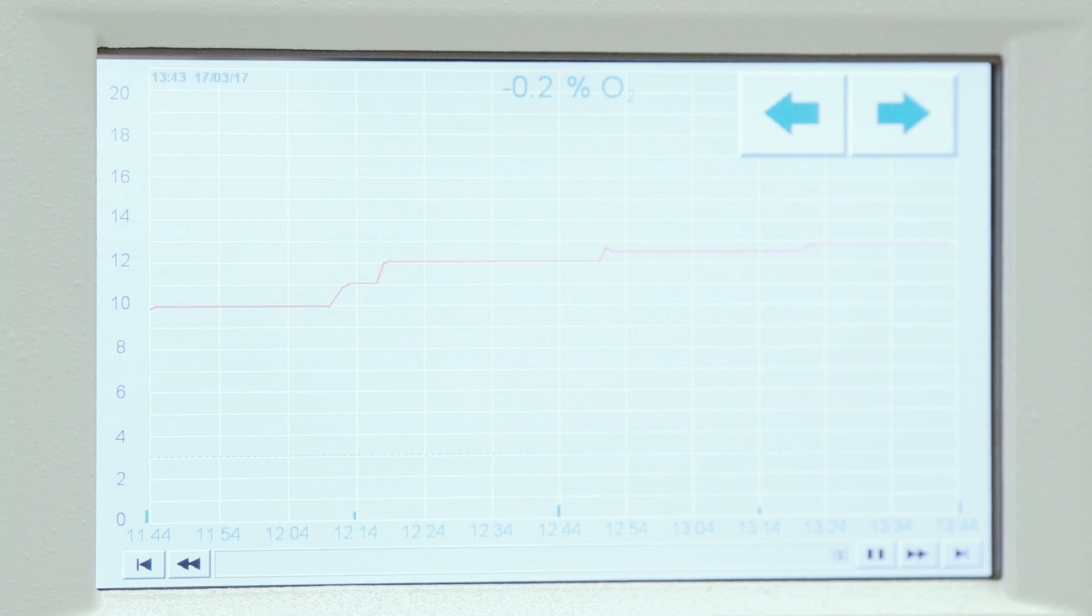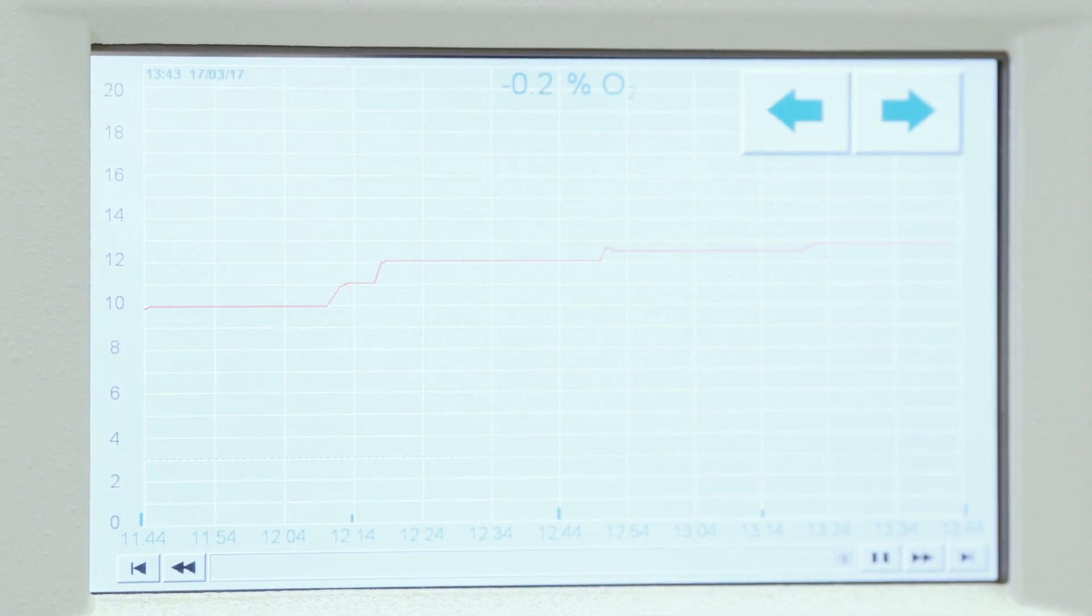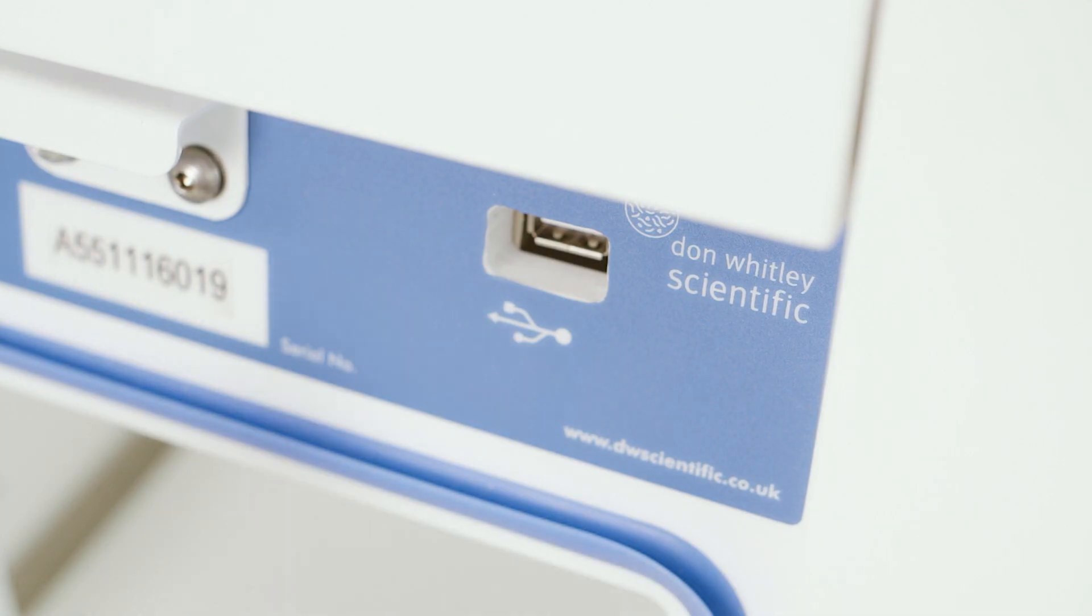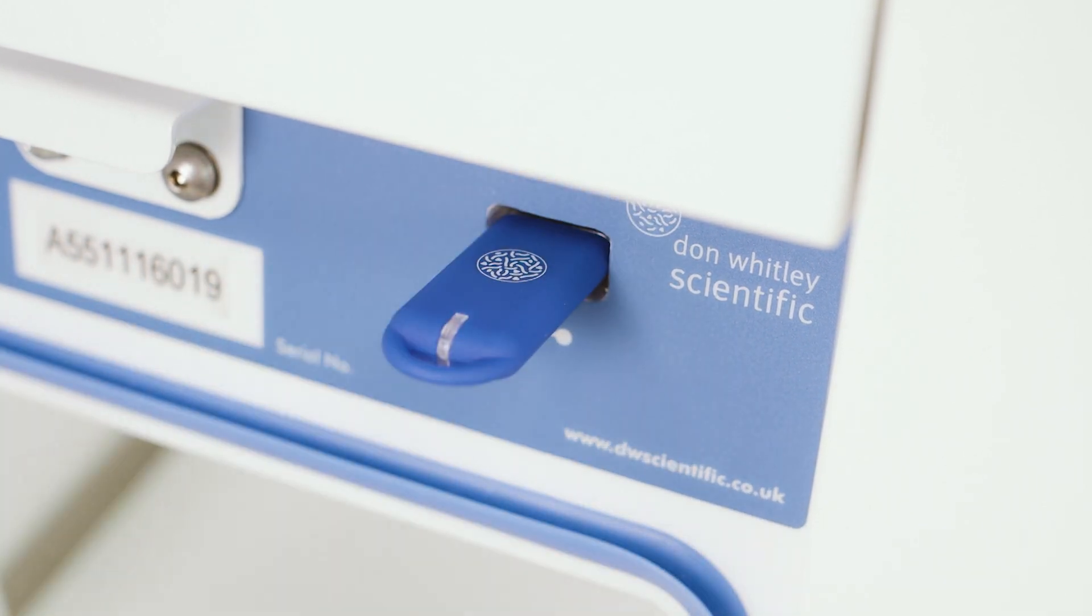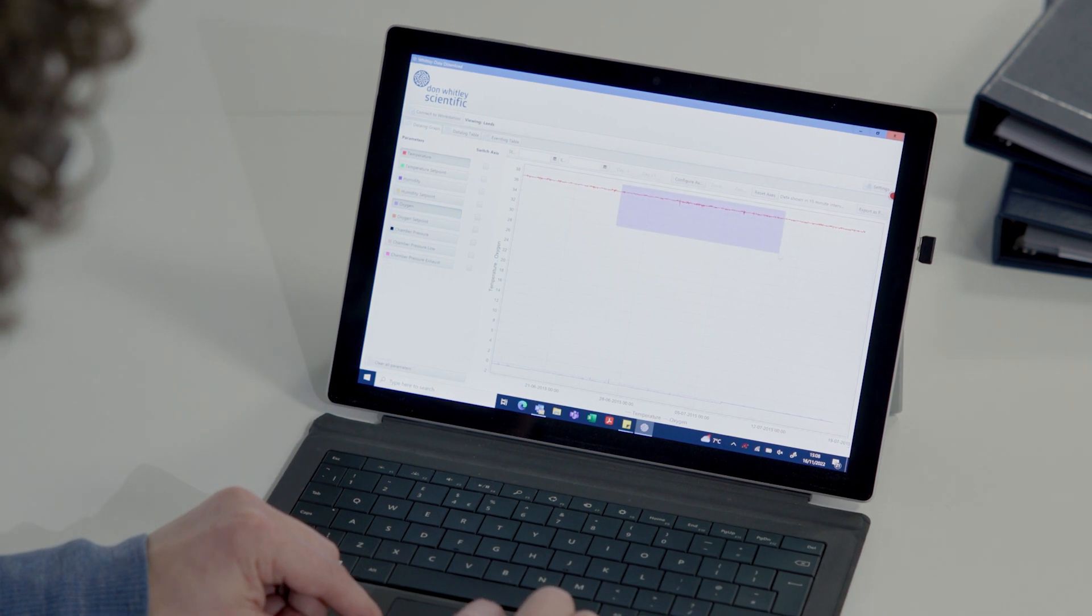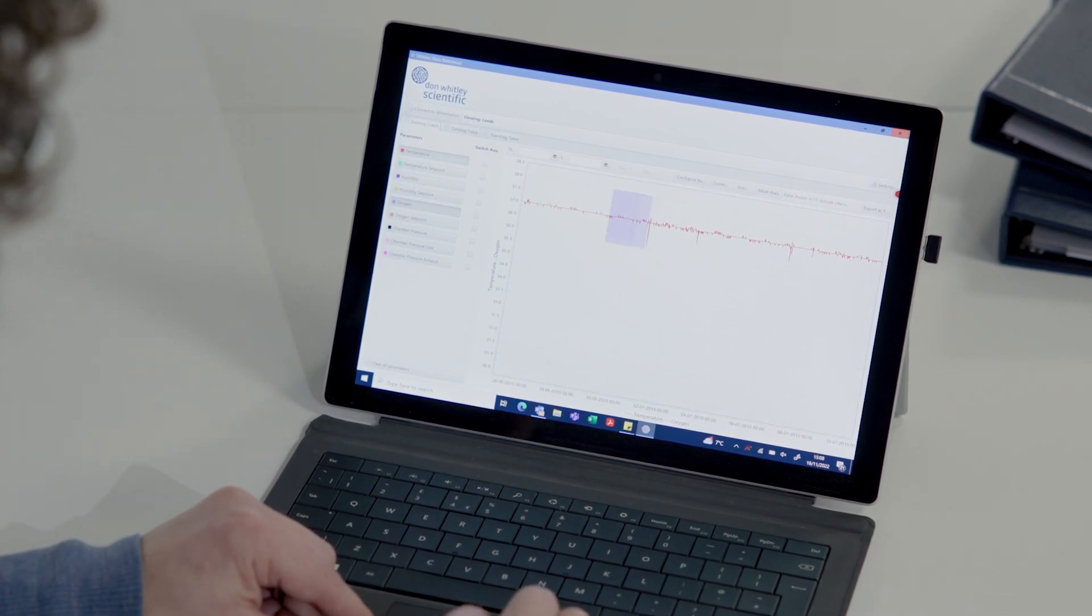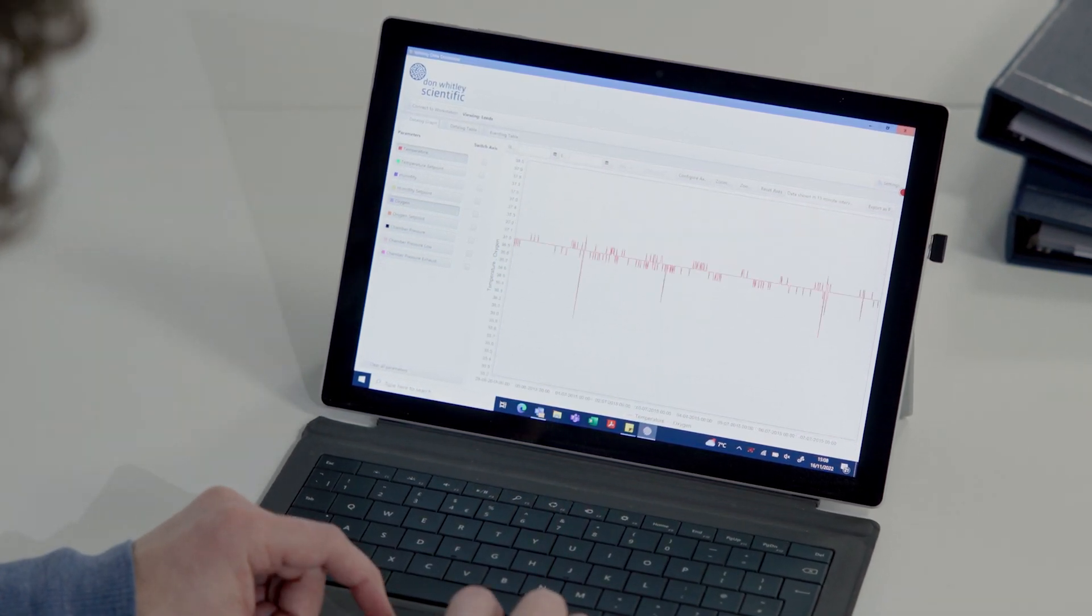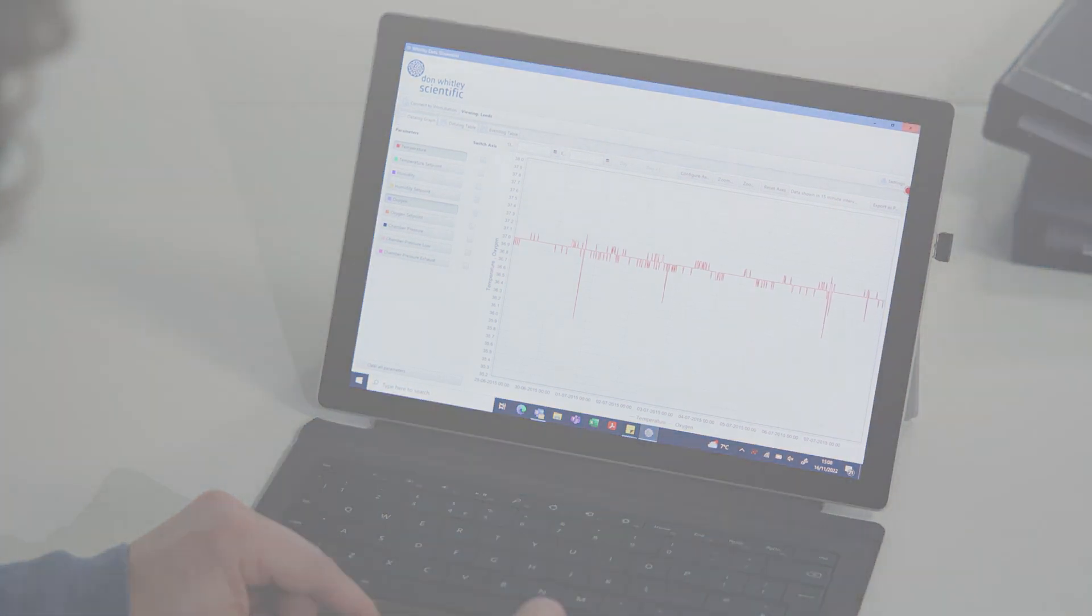The recorded data can be viewed on a screen or downloaded in a few seconds to a memory stick for further analysis in a spreadsheet. Parameters such as temperature, humidity and oxygen levels can also be monitored remotely and alerts can be sent via email directly from the workstation.